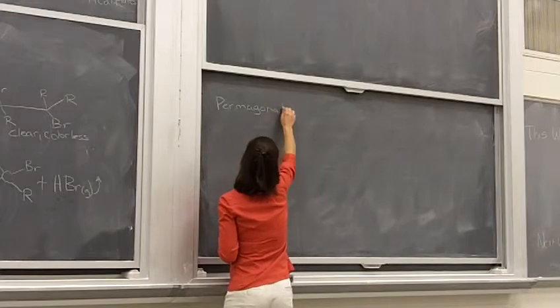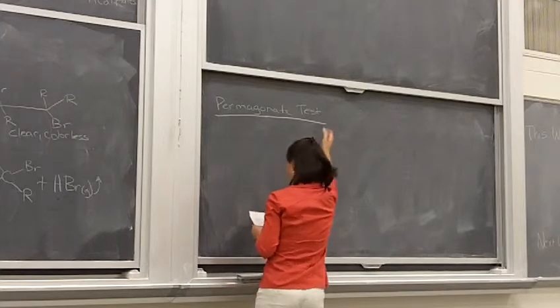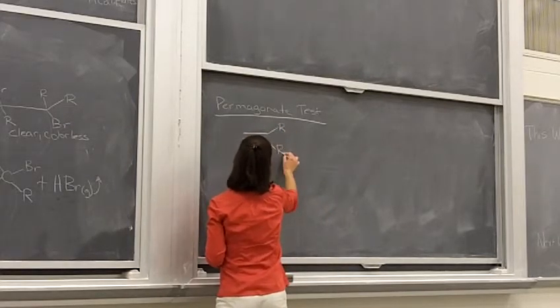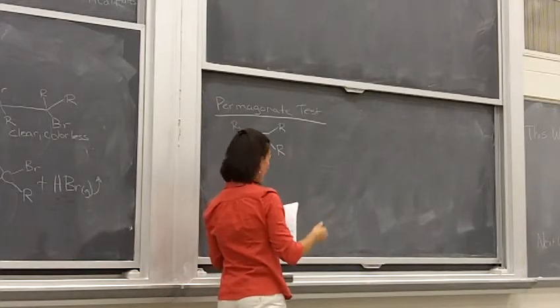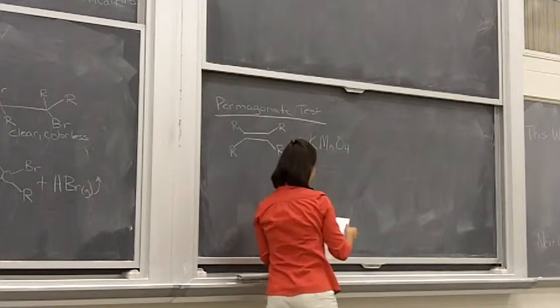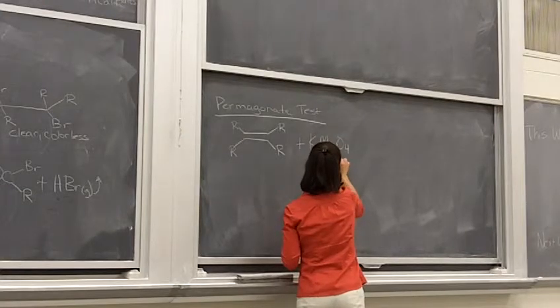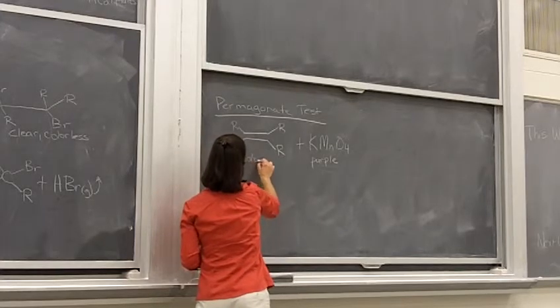So you guys may remember permanganate from Gen Chem lab. It's a nice purple solution. You don't want to get it on yourself because it turns your skin brown. So again, use it in the hood and wear gloves so you don't turn yourself brown. Otherwise, if you do turn yourself brown, we know that you weren't wearing gloves. So the permanganate solution is a nice, eggplant purple colored solution, okay? Again, our alkene is still colorless and clear.